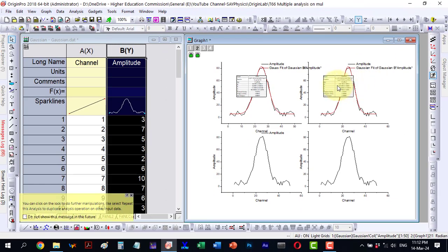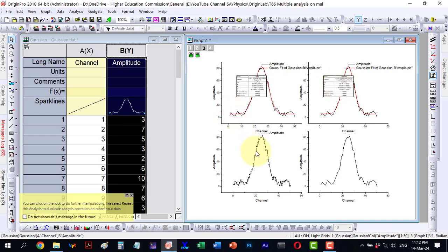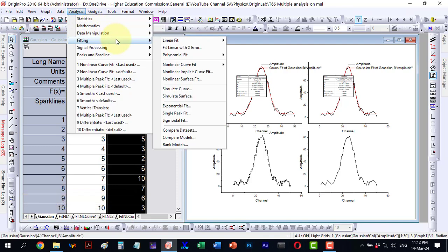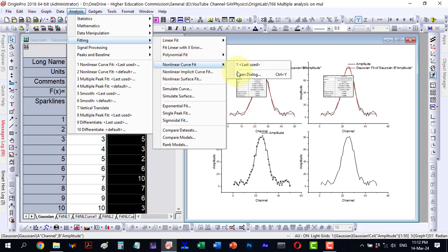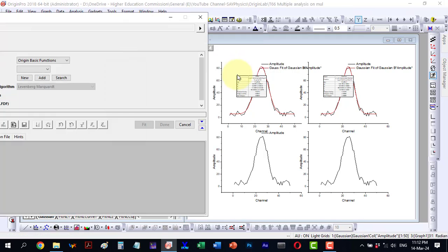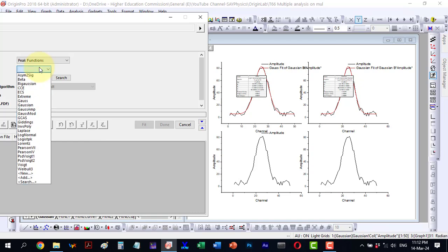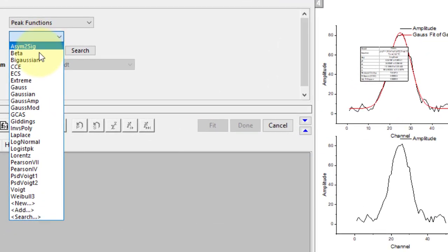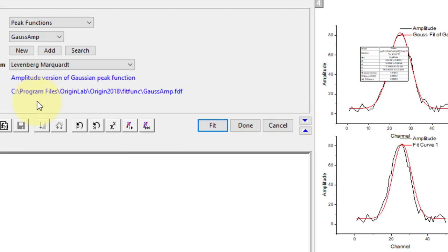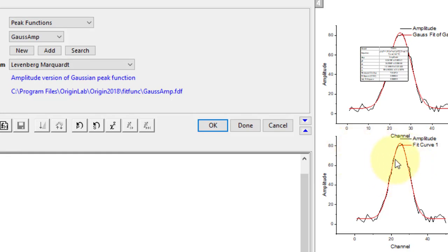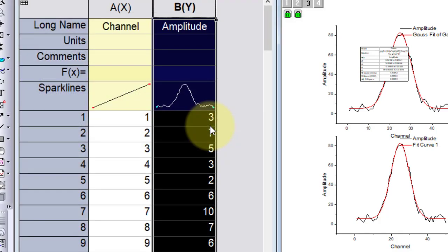Yes, here it is and I will examine it shortly. Now, I will select this one and proceed to analysis, then fitting, non-linear curve fit and open the dialog. Under peak functions, I now opt for the new function, the gauss-aim function. Here it is. I perform some iterations and continue fitting until it converges. After fitting, I click OK and its data will appear here.